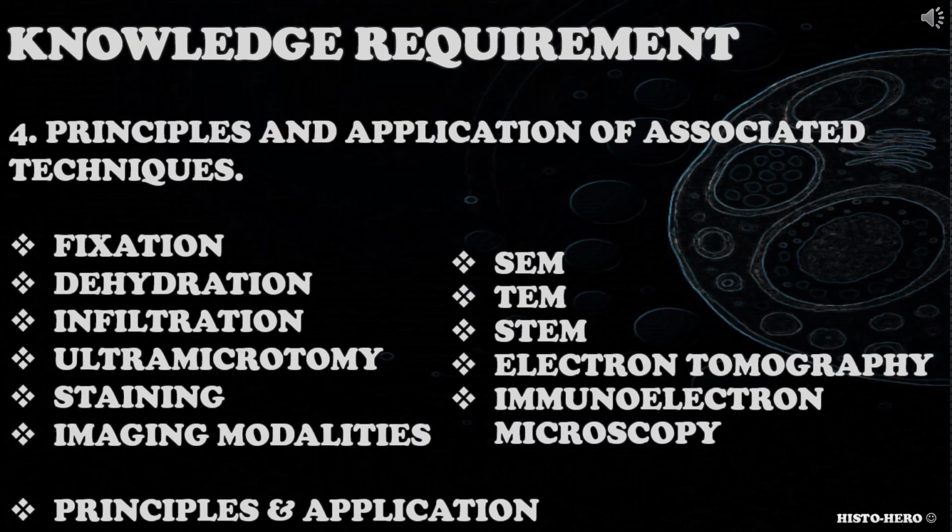When addressing this knowledge requirement, candidates should consider tissue preparation, fixation, dehydration, infiltration, ultramicrotomy, staining with heavy metals or negative staining, imaging modalities like TEM or transmission electron microscopy, SEM or scanning electron microscopy, STEM or scanning transmission electron microscopy, electron tomography or immunoelectron microscopy.